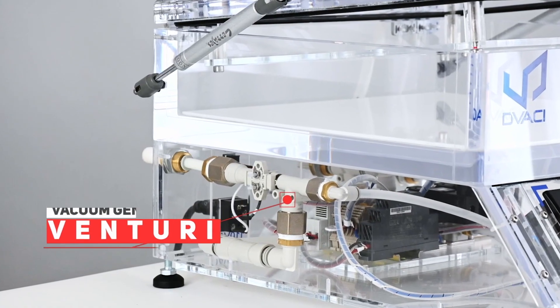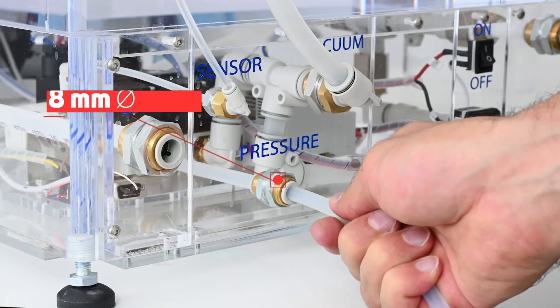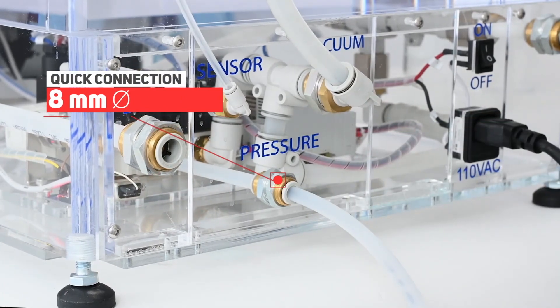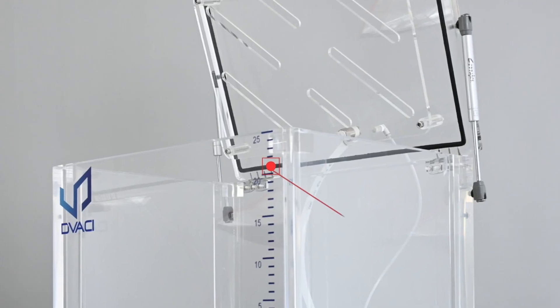The vacuum is generated through an integrated Venturi system, which requires a compressed air supply to operate. Connections are located on the back of the tester, which facilitates organization of hoses and wiring.